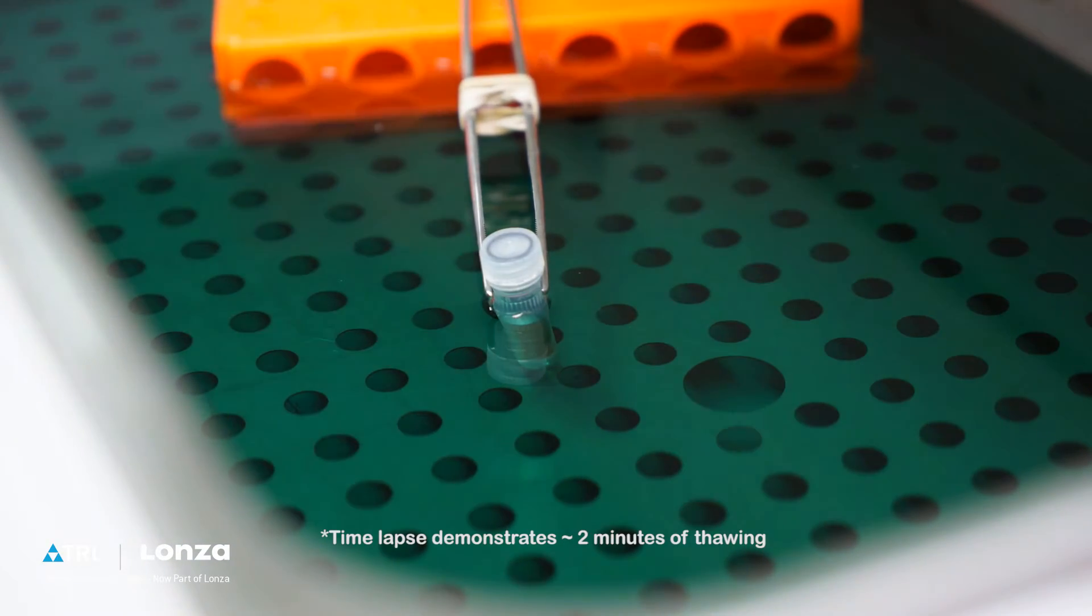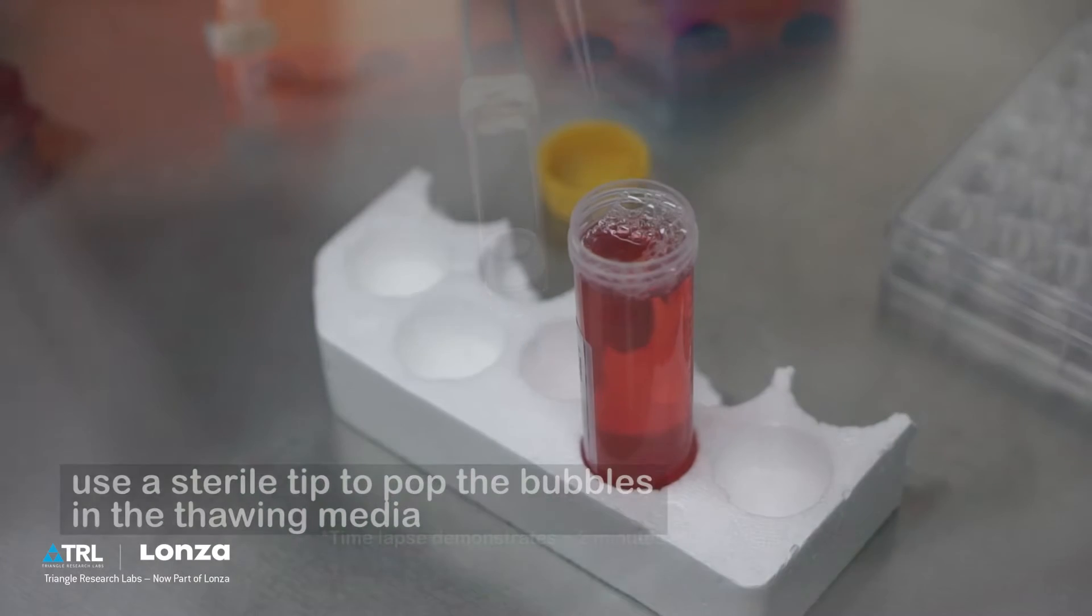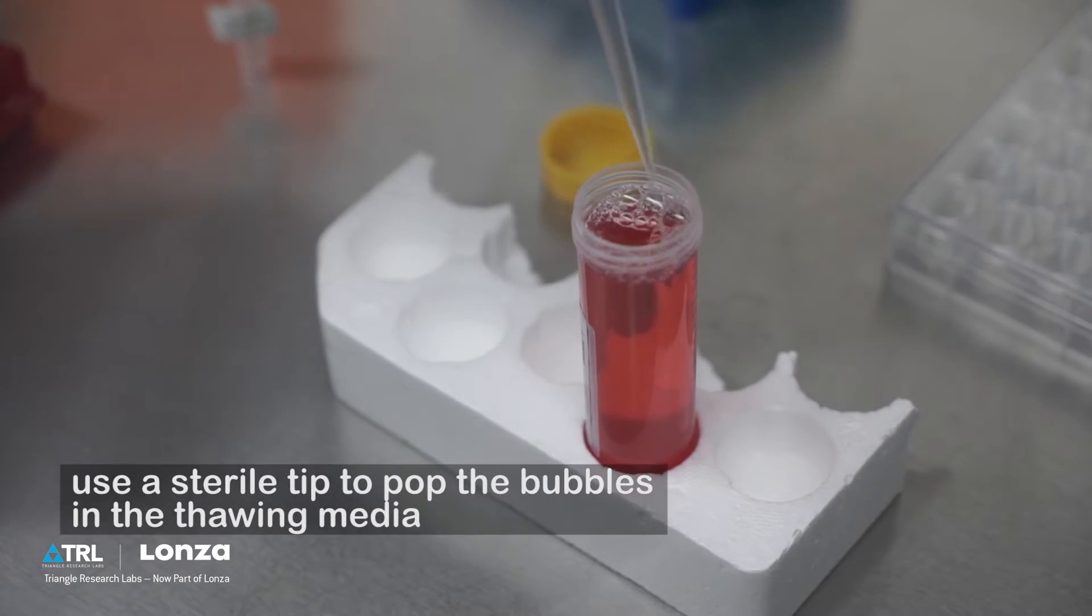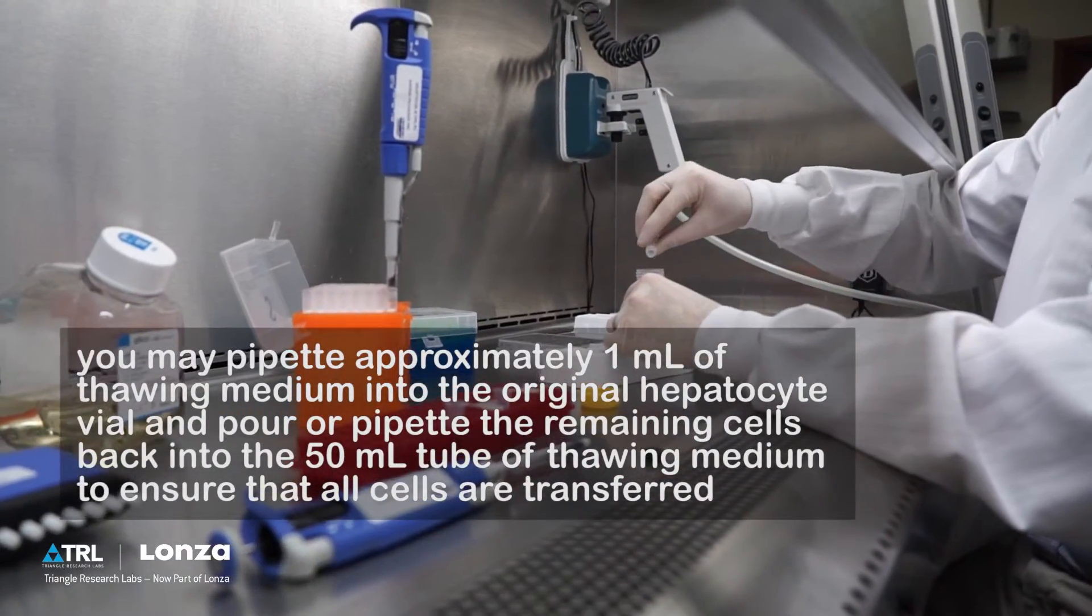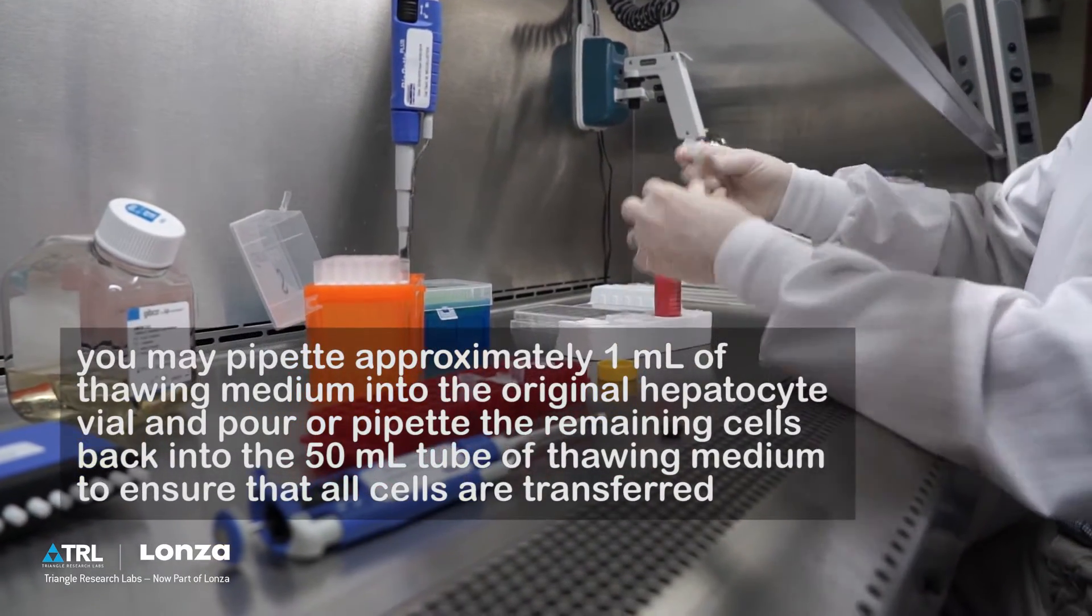Once thawing is complete, disinfect the vial with ethanol and transfer it to the biological safety cabinet. Prepare thawing medium for hepatocytes by popping any bubbles that may have formed. Pour hepatocytes into a 50 milliliter conical tube of thawing medium.